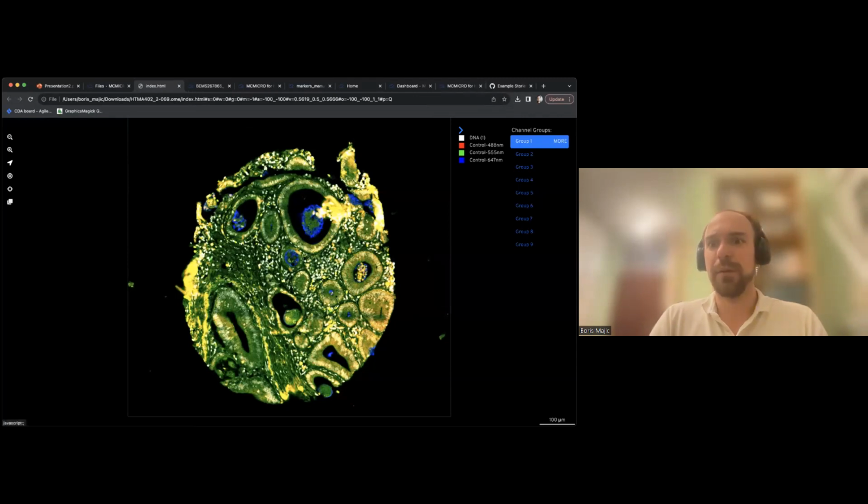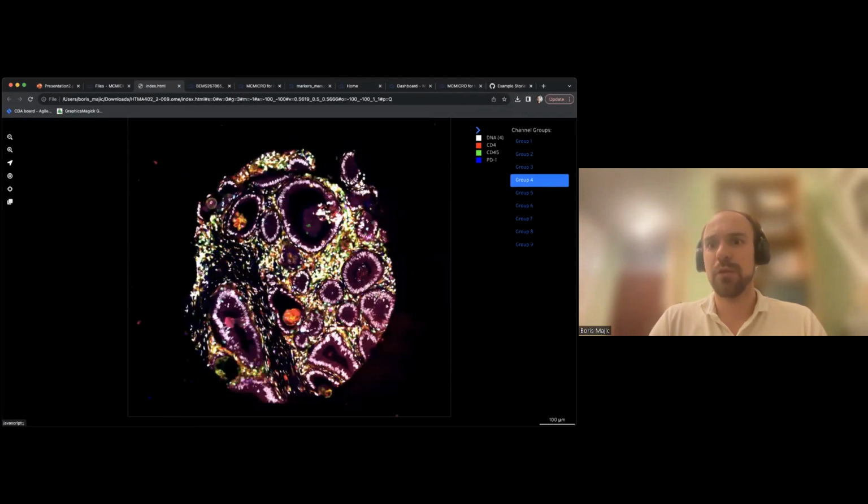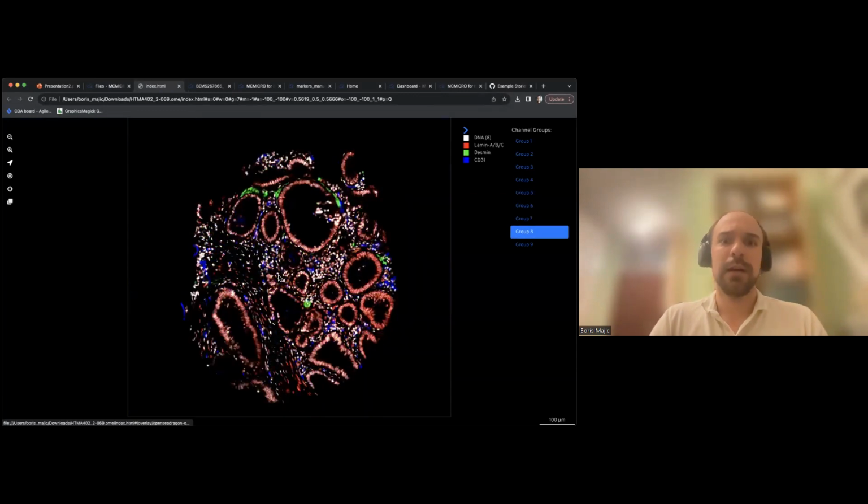This is the AutoMinerva report, and AutoMinerva has selected several groups, which are combinations of different channels that you might want to explore, with the description of which channels were used and which color was used to label the corresponding channel.